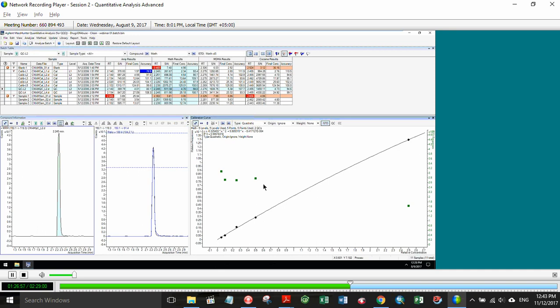Okay. Another question here. Just for clarification, renaming a user-defined column cannot be accomplished within MassHunter Quant? Renaming a user-defined column. I think what they're asking us there is the header information, user-defined 1, 2, and so forth. I would have to check into that. There may be a configuration file that's available. Is the user-defined field an editable field in the batch table? Yes, I believe it is, because we could fill in the values in the batch table.